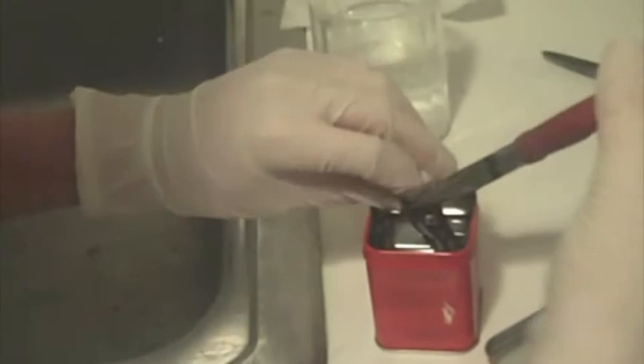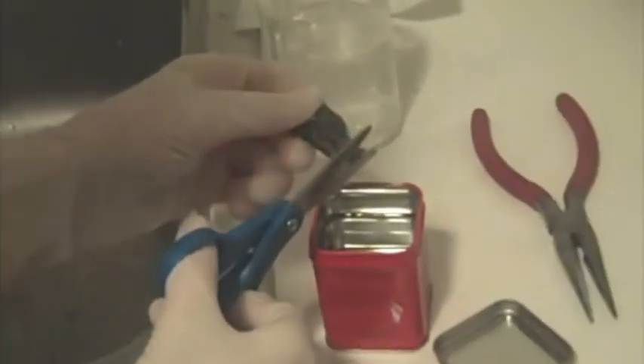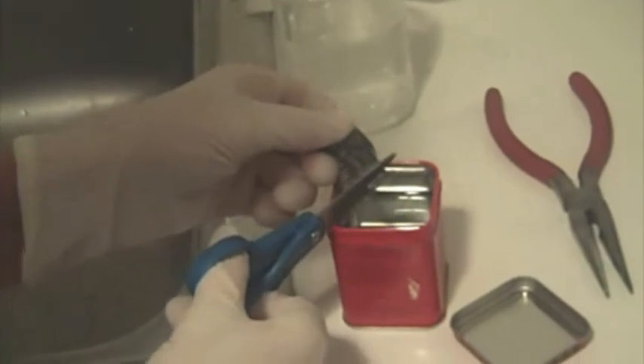I'm going to cut a bigger piece of lithium off so you can see it even better. I take out my lithium, which I store under baby oil, which is mineral oil basically, and I'm going to cut a small piece off, but even though it's small, it reacts pretty vigorously with water.